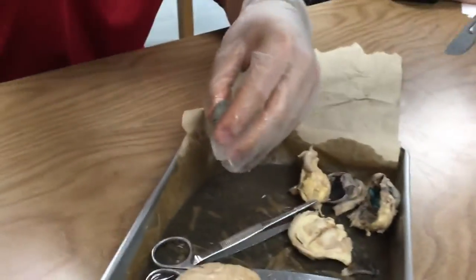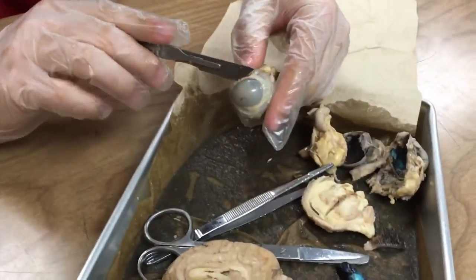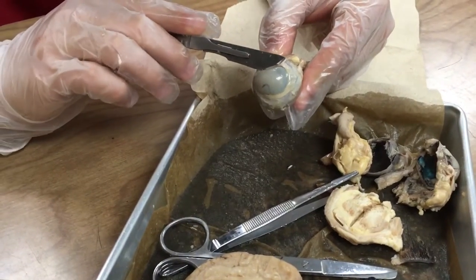Can I see the scalpel? It has to say scalpel. This is the brain stem, right? Yeah, definitely.